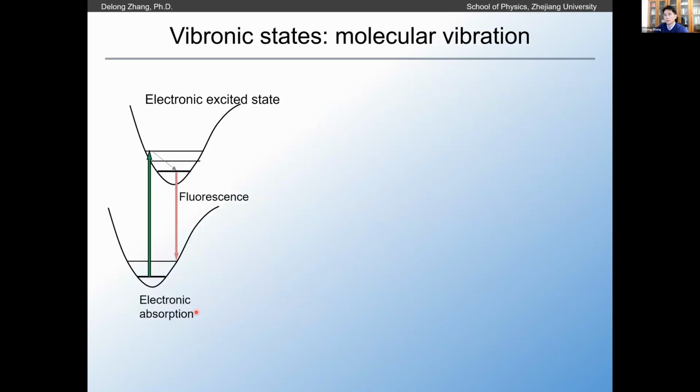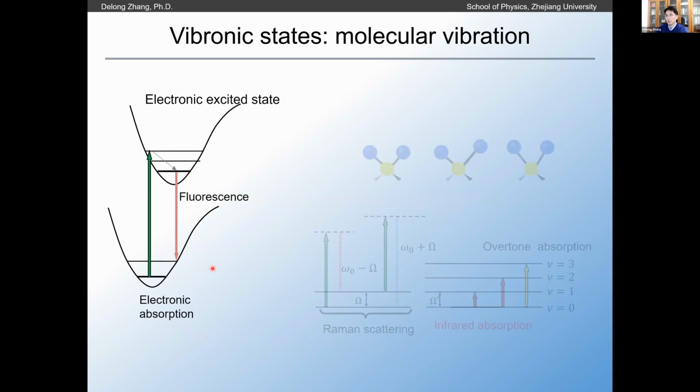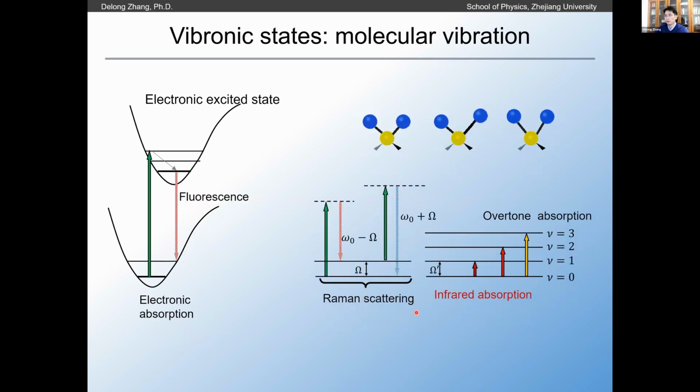This is triggered by molecular vibrational spectroscopy, where besides electronic absorption, there are various spectroscopy modalities, including Raman scattering and infrared absorption. I think the audience will be very familiar with this, so I will skip the details. With infrared and Raman, we can depict the molecular structure.